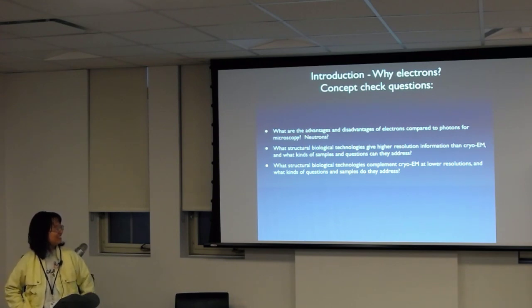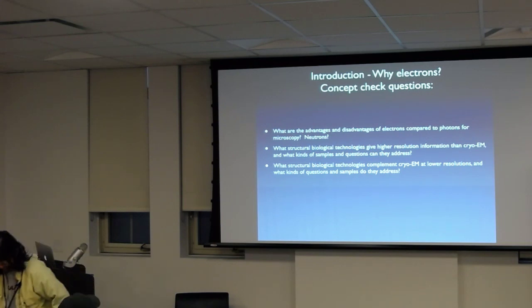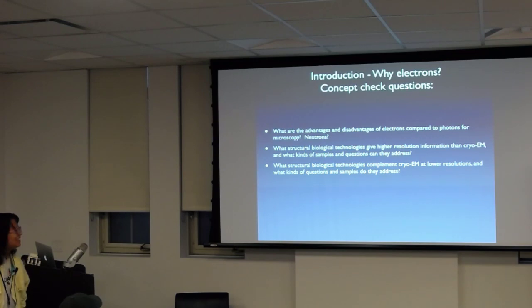What structural biology techniques complement cryo-EM at lower resolutions? Sure. That would be more SAXS. SAXS is definitely not the microscope. Yeah, exactly. So tomography many was considered a low resolution, but it's actually hitting close to, not atomic resolution, but in the 5-6 angstrom range. Parallel to SAXS is also SANS. You can use neutrons for your small angle scattering.